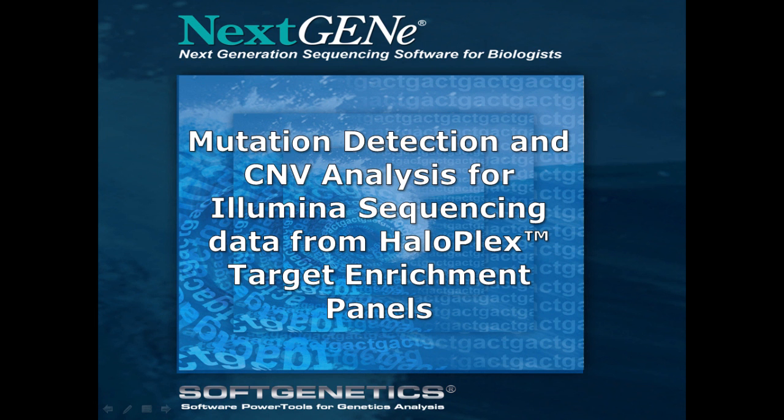This webinar will cover mutation detection and CNV analysis for Illumina sequencing data using HaloPlex Target Enrichment Panels. I'm John McGuigan, and I'm a biologist at SoftGenetics.